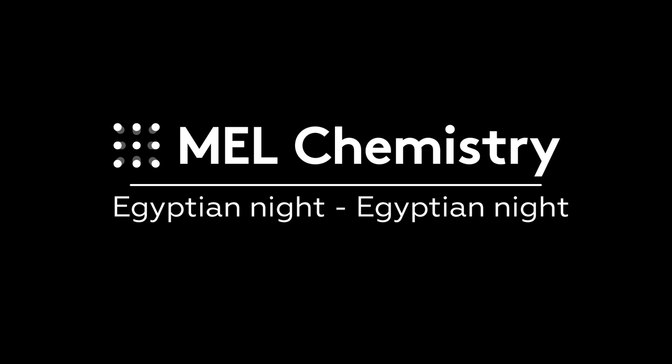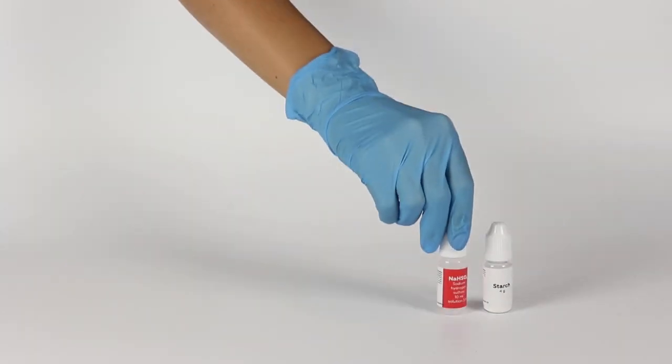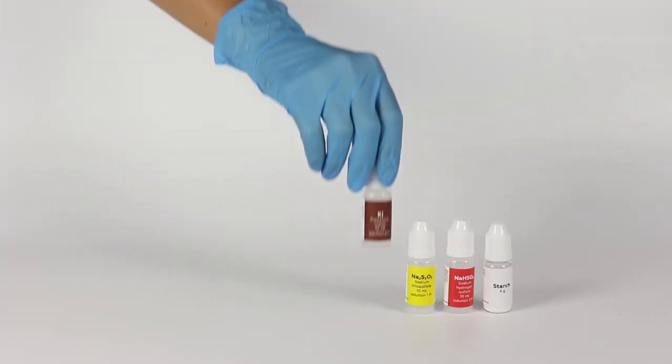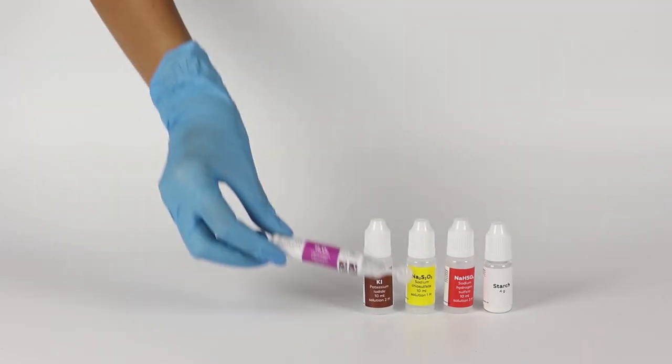For the Egyptian Night experiment, you will need some starch and solutions of sodium hydrogen sulfate, sodium thiosulfate, potassium iodide, and hydrogen peroxide.